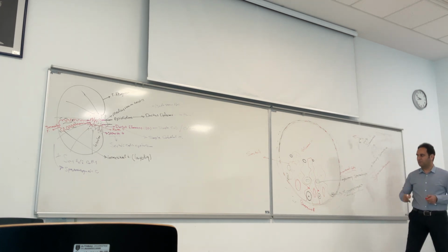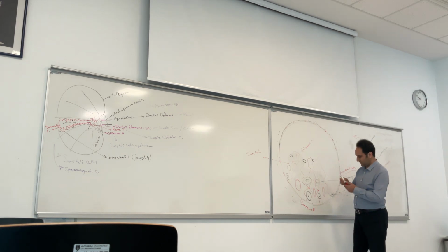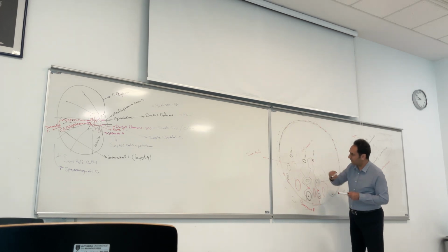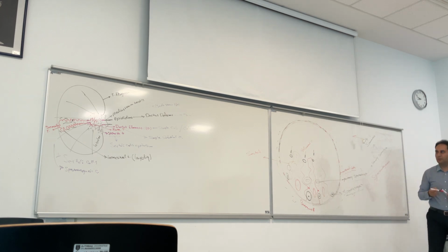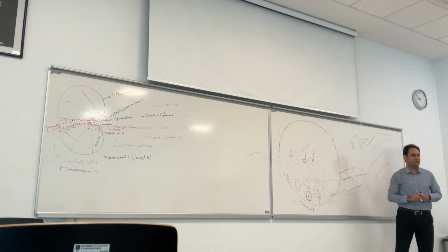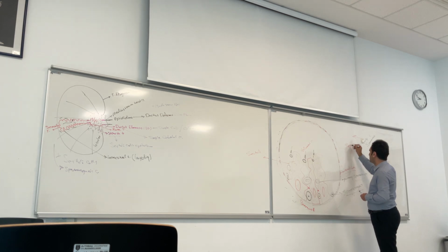The transformation from this round shape to this shape: a flat nucleus with a tail and acrosomal head. This stage, changing from round shape to flat shape, is known as spermiogenesis.